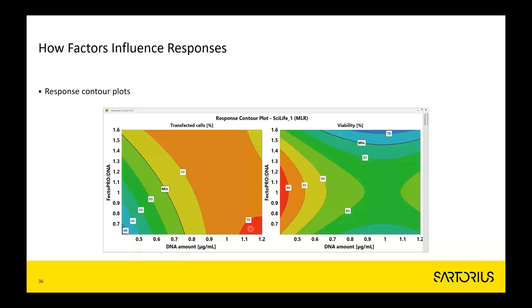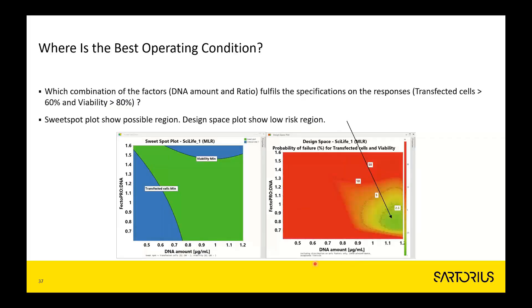Since the two responses are conflicting, a compromise must be found where there is a low risk of failing to comply with specifications of being above 60 and above 80 percent. A sweet spot plot shows the best operating condition — which combination of the two factors gives the best chance of fulfilling both responses. More contemporary tools can also assess the risk of failure to comply with response specifications, with the arrow indicating a low-risk gradient region.